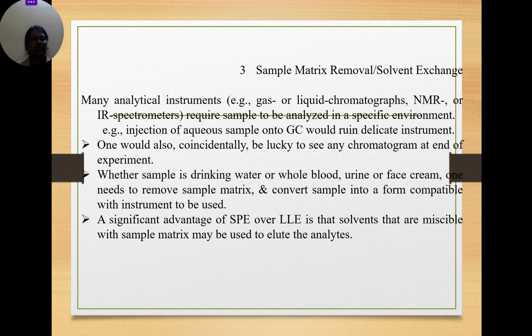So this kind of technique is not suitable because they need a specific environment. Whether a sample is blood, urine, face cream or anything, it has to be converted into a compatible sample for the instrument. So the instrument has to take the sample properly without any deterioration or damage. So we have to prepare the sample in such a way that the instrument is also compatible.